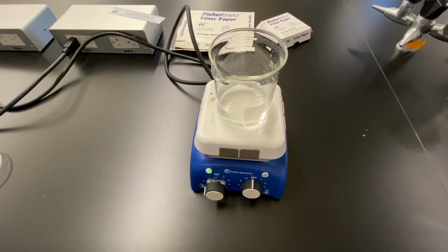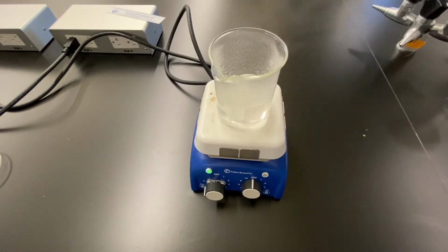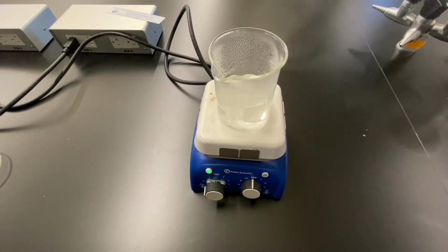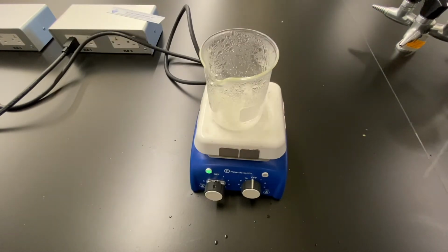And this piece of equipment that we've placed it on is called a hot plate. Pretty cool thing. On the left-hand side, you see the dial that controls the heat. On the right-hand side, we have a stirring function. There's a little magnetic part of this piece of equipment, so if you put a magnetic stirring bar into your solution and turn that up, it'll spin and stir the solution, which is pretty nice. So you can get a nice even heating. In this case, we don't really care about that. We're just boiling off some water, so we don't need to stir. We can just use heat.